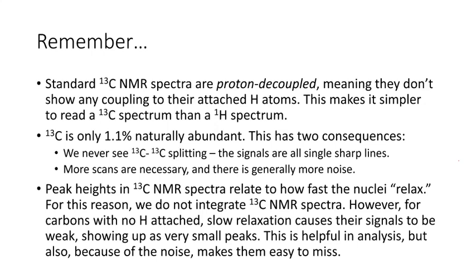And frankly, we decide to not wait the sometimes 30 seconds it takes for a C13 nucleus to relax. And what happens is some of them just don't relax and they don't give a good signal the next time and the next time, and pretty soon they're just not giving any signal at all. So we can't integrate a C13 spectrum.